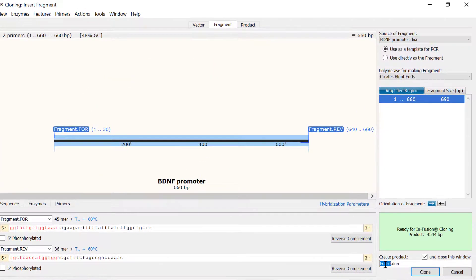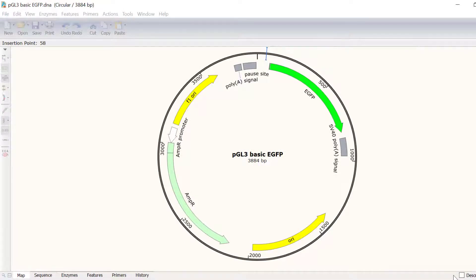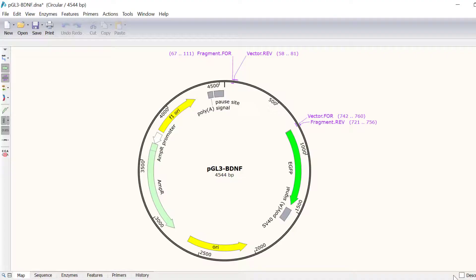Finally, I will call the file pgl3-bdnf and click the clone button to simulate the infusion cloning.